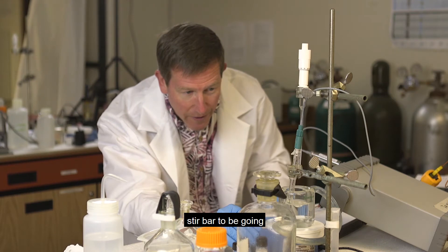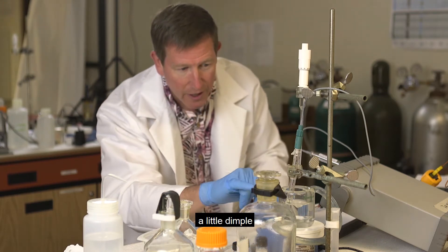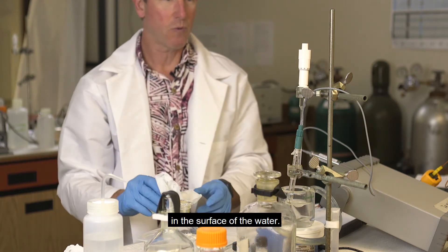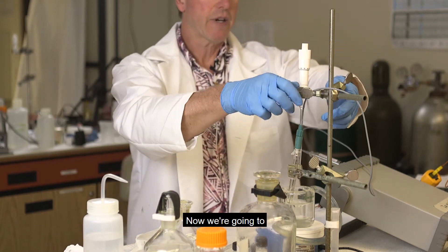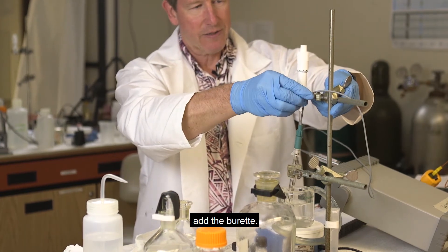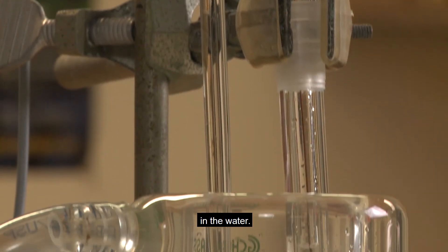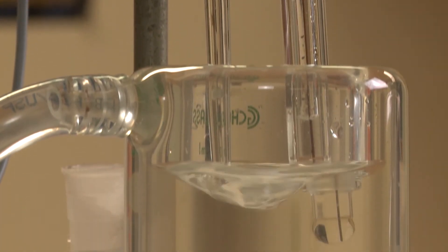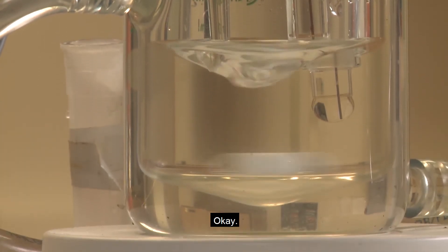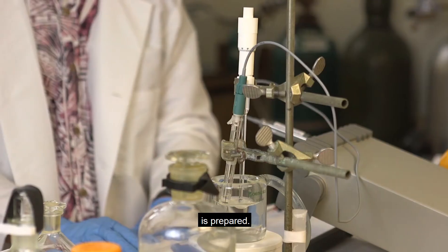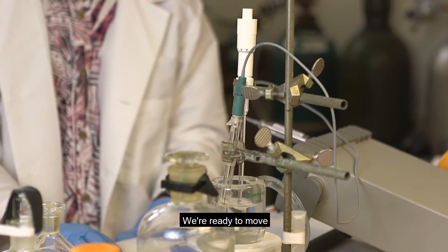And you want the stir bar to be going fast enough to just create a little dimple in the surface of the water. Now we're going to add the burette. You want just the very tip of the burette to be in the water. Okay, so now the sample's prepared, we're ready to move on to step three.